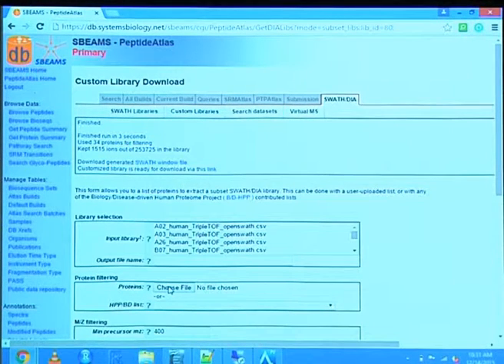and it's done. And you see here our 34 proteins. It used these for filtering. It has about 1,500 ions. These are all the transitions. If you divide that number by 5, you should have the number of assays that you have from the library. And then you can, on one hand, download the SWATH window file.